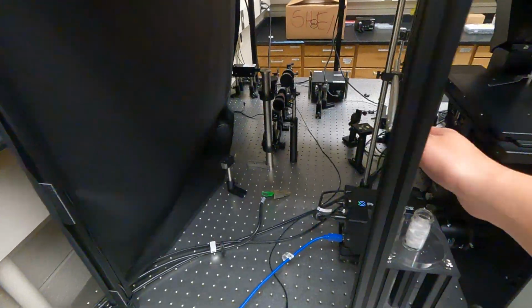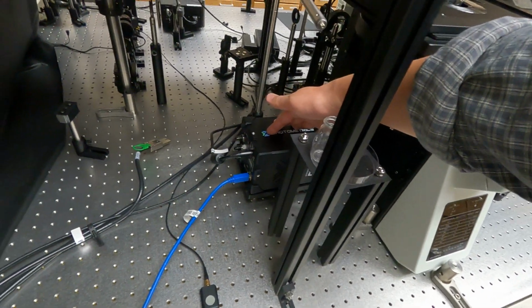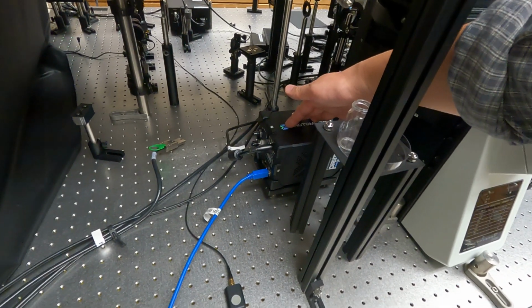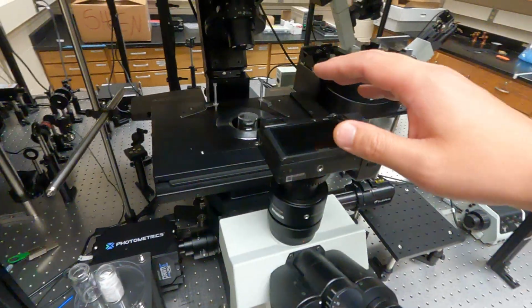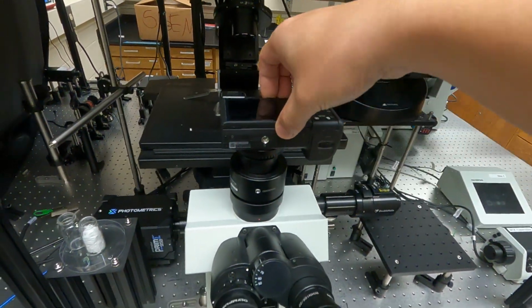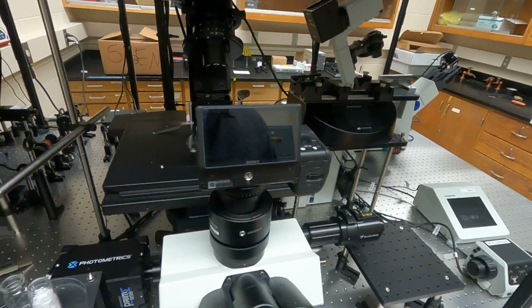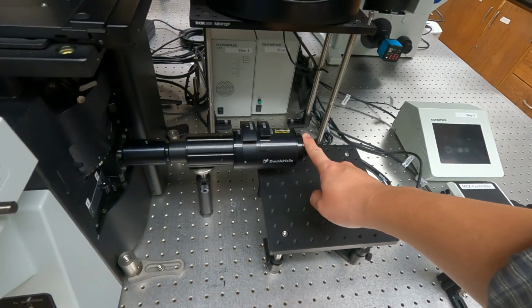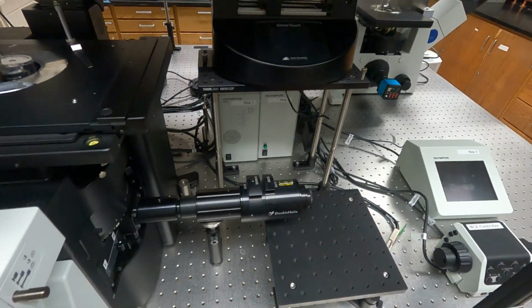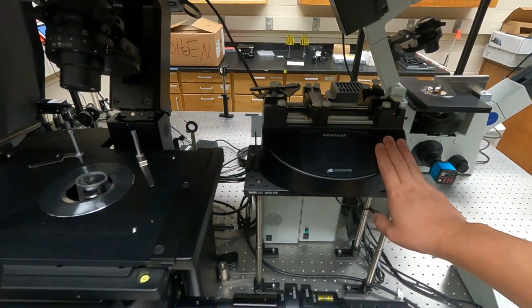We have a few little cameras attached to this microscope body. This is a very highly sensitive camera that can achieve single molecule detection. A consumer grade DSLR camera is attached to the top of the microscope body. Another camera port is available for an additional camera. We also have the sample injection pump here.